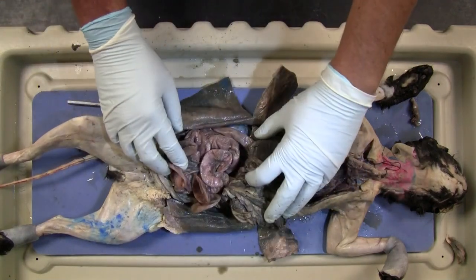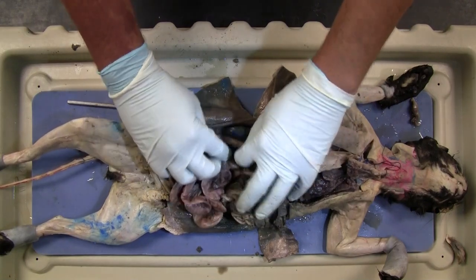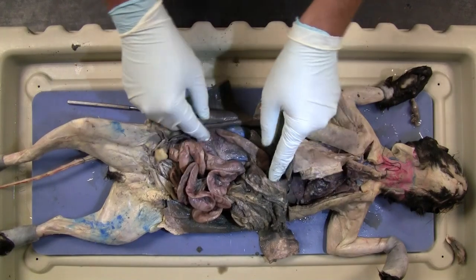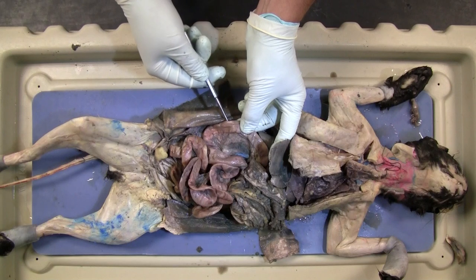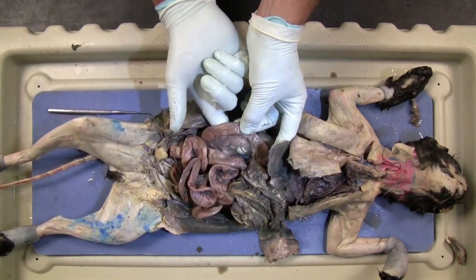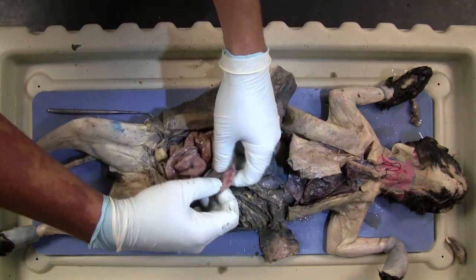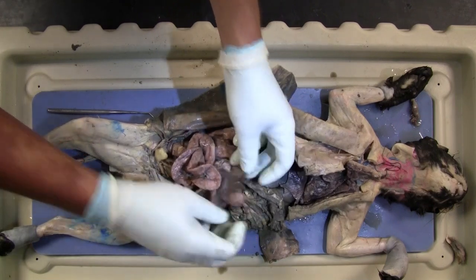Now, once you have the omentum done, you're going to do the mesenteries. Mesenteries, you're going to look for the mesoduodenum, that C shape right here. This, right here. The membrane that holds the duodenum to the dorsal body wall is your mesoduodenum. So all of that underneath there is your mesoduodenum. Up here, that holds your jejunum in, is your mesentery proper.